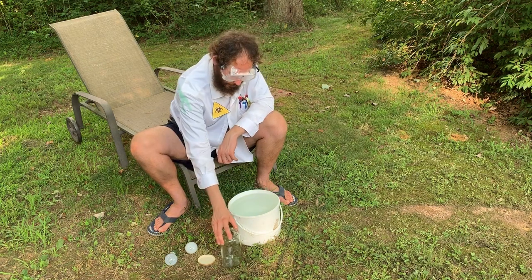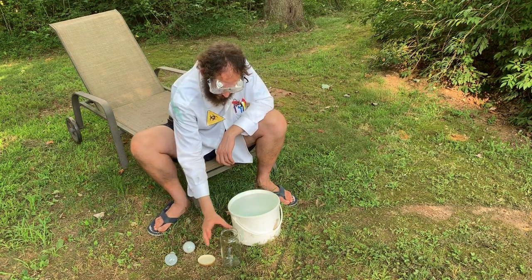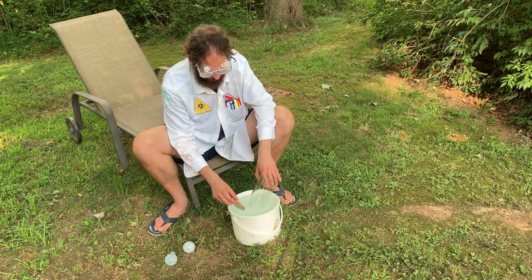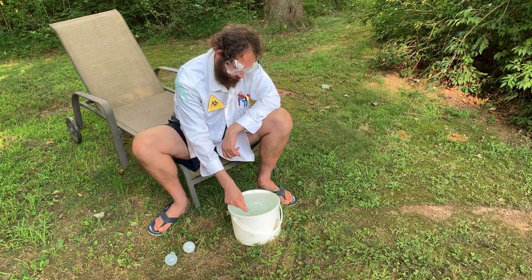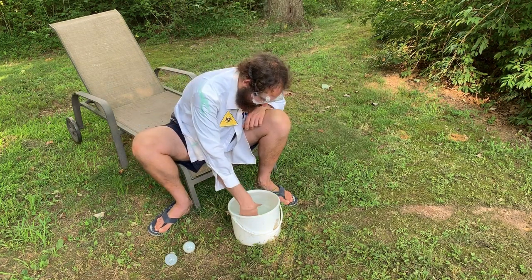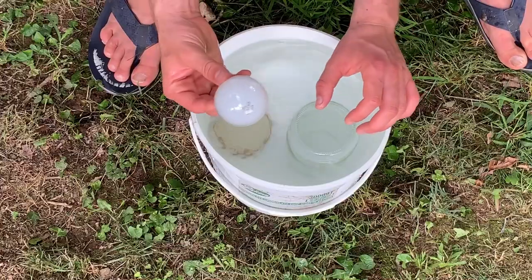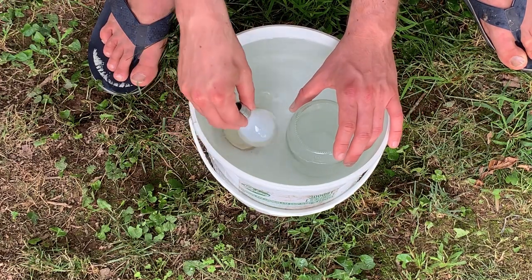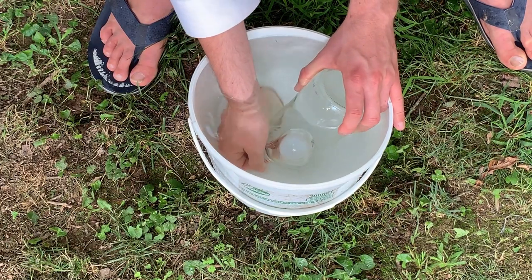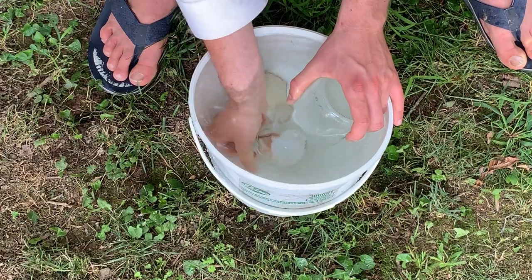This jar is going to collect the argon gas that's inside the incandescent light bulb. Let's begin by taking the jar and the lid and putting it into the water. You want to make sure that all the air bubbles are out of the jar. Then submerge the light bulb, put it inside the glass jar, and very carefully apply pressure to the incandescent light bulb.